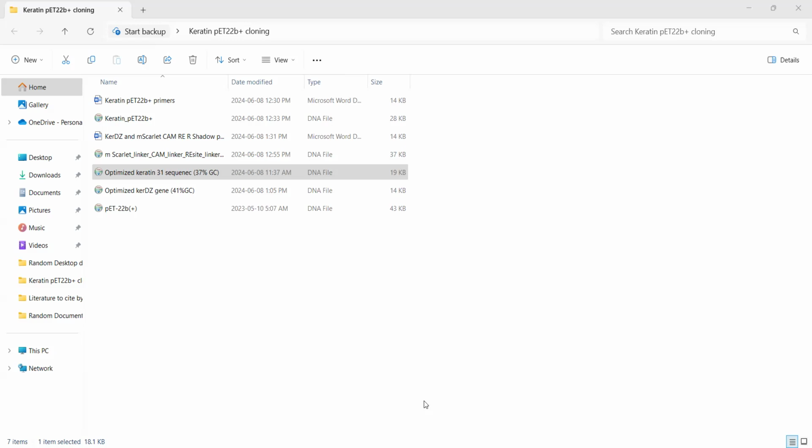However, you try your best. So for this one, you can see that there are many G's and T's, and you again try to end with G or C. So let's go to 26, for example. So we will go to Control C and copy this forward primer extension and check for TMs. Of course, we will delete the rest.